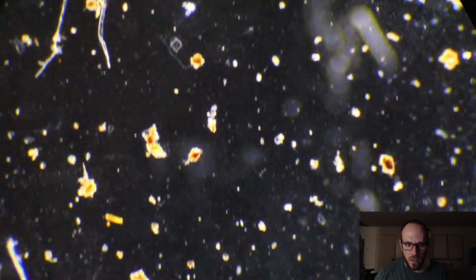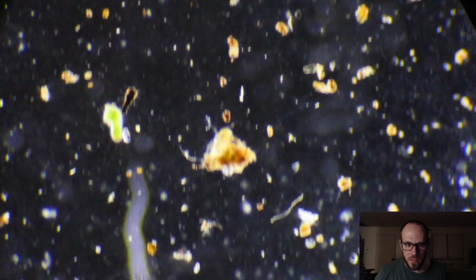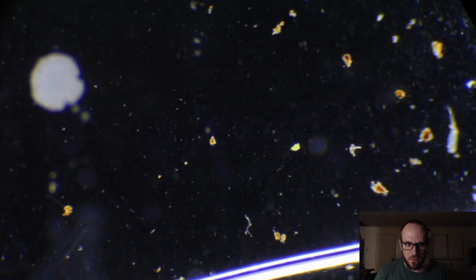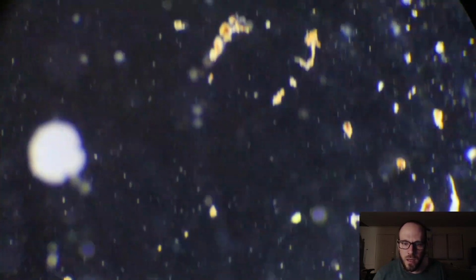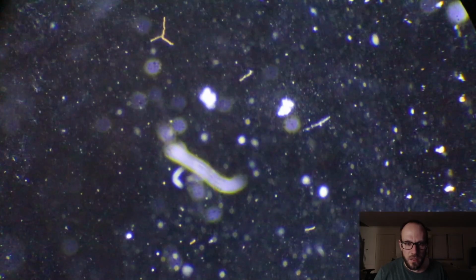What sucks, too, is when a lot of these microscopic organisms die, they just kind of explode and turn to nothing. So it's tough to ever even know they were there. What's that thing? It's nothing. But earlier I found a dead rotifer, which was really surprising, on a different slide. The one that I think the bacteria overcame. And I'm pretty sure this slide's just garbage.